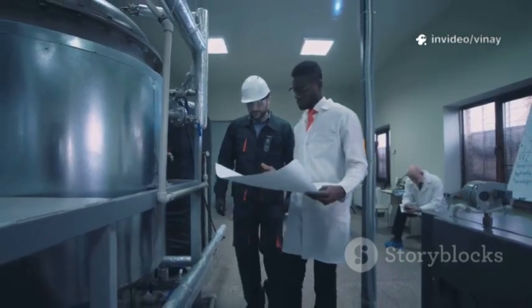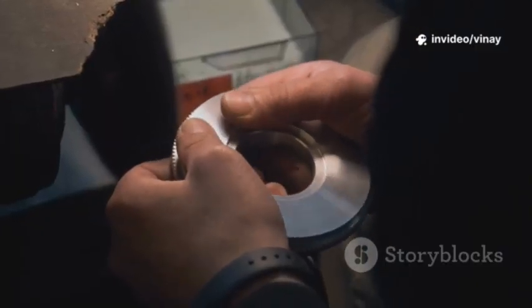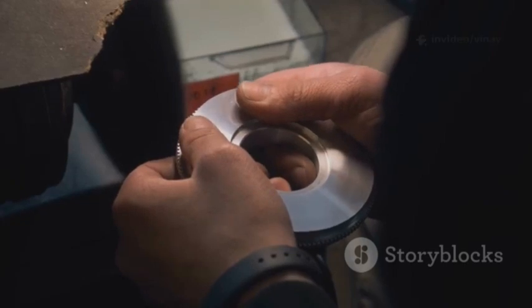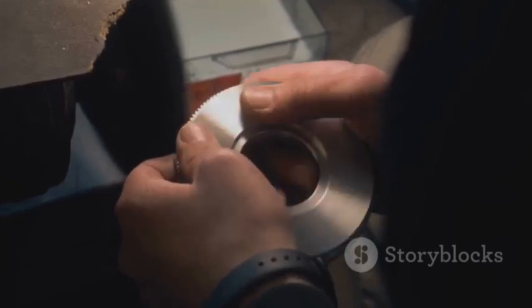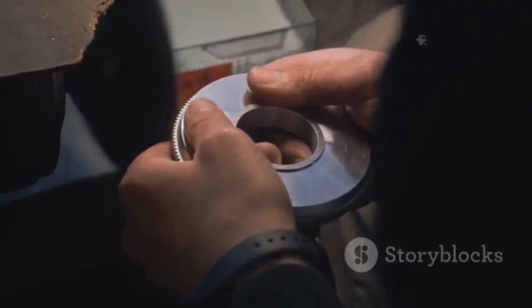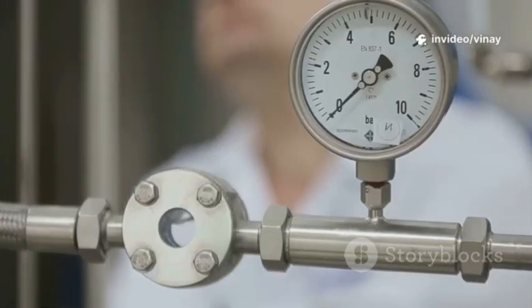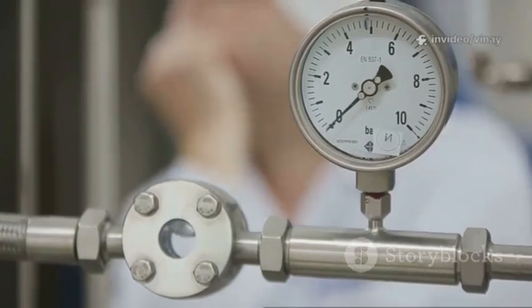Testing is our way of finding these invisible flaws. This is where the idea of integrity comes back into play. An integral filter is one that is structurally sound and meets its design specifications perfectly. It has no defects, no oversized pores, and no damage. The tests we're going to talk about are designed to challenge the filter in a non-destructive way.